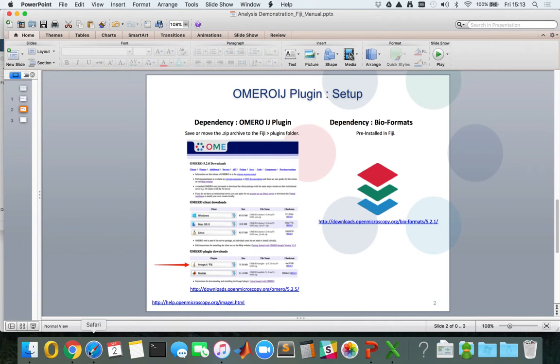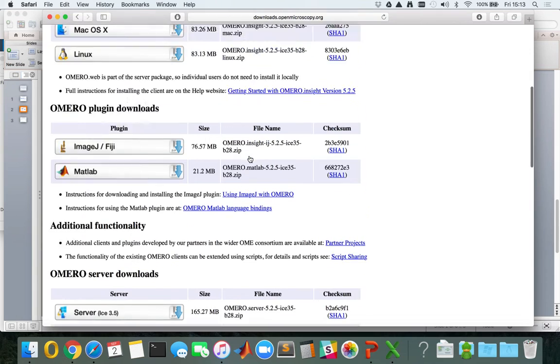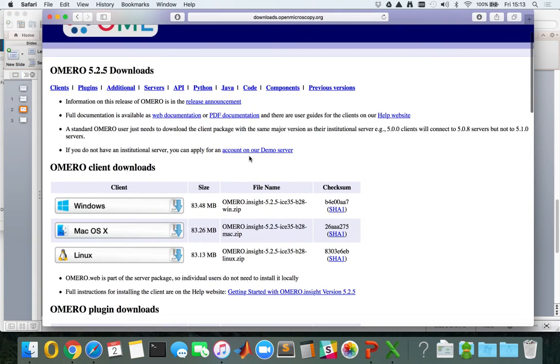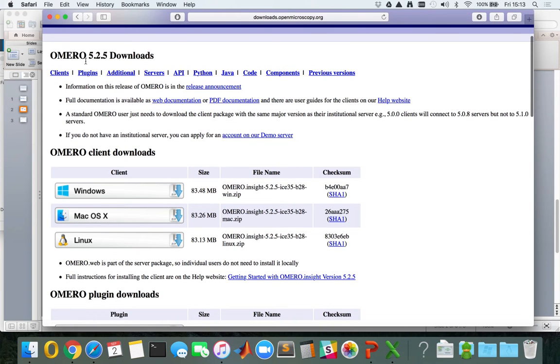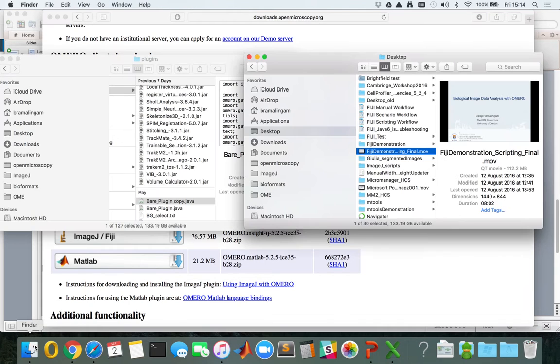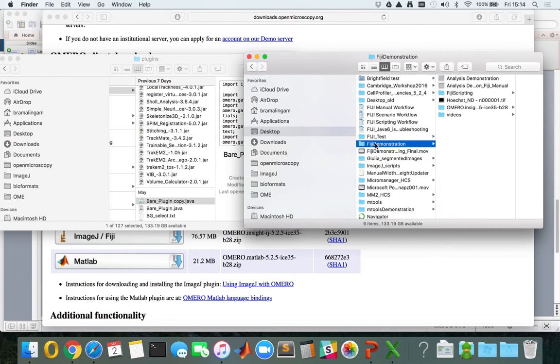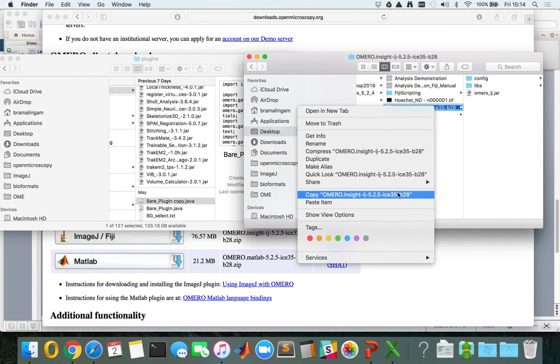To give you a brief overview of what I've been talking about, this is the downloads page of OMERO. This is the latest OMERO release and you can see under the plugin download section the OMERO ImageJ plugin. I have downloaded it locally and now let's start with the installation process.